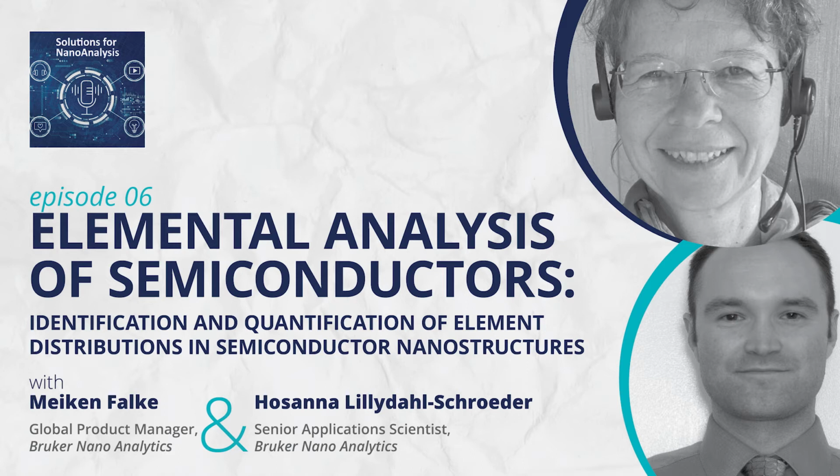Yeah, you are right. We are supposed to talk about semiconductors. And that was also the next group of materials I wanted to mention. And that is what doesn't come to mind immediately. Actually, one aspect is that in modern semiconducting devices, there is a surprising amount of different elements mixed together. And EDS is again useful to get an overview of all the whereabouts of these elements.